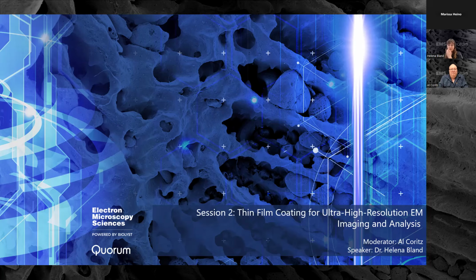Today's tutorial, presented by Dr. Helena Bland, is about conditions required to produce ultra-high resolution EM images and elemental analysis using thin film deposition.